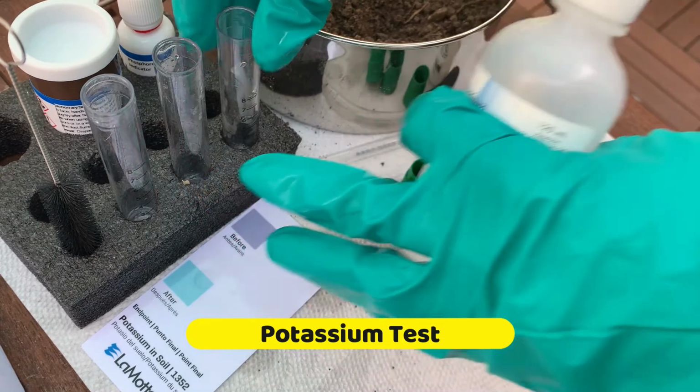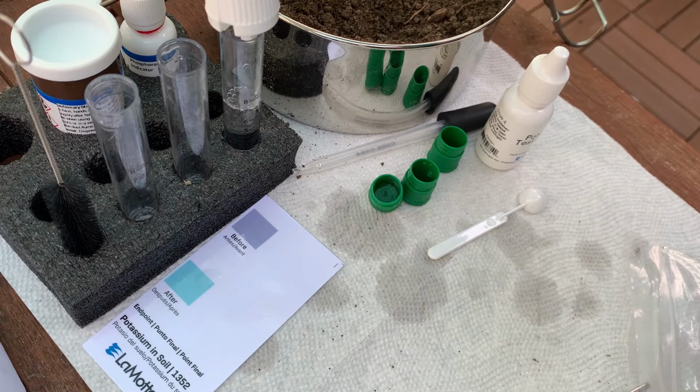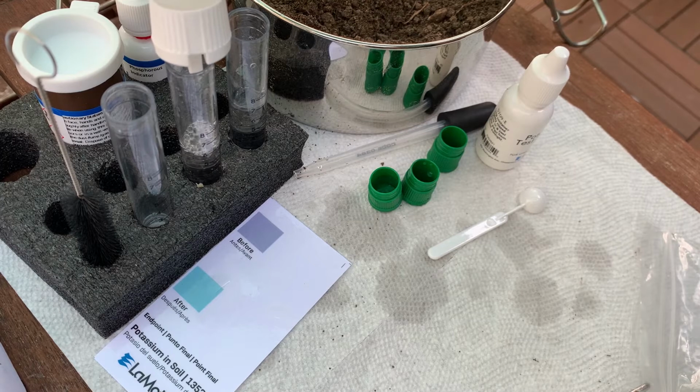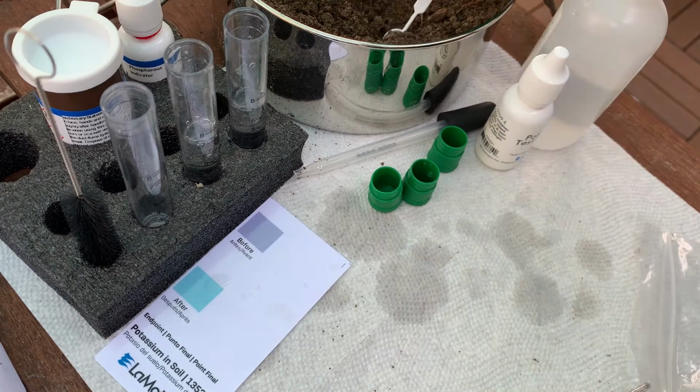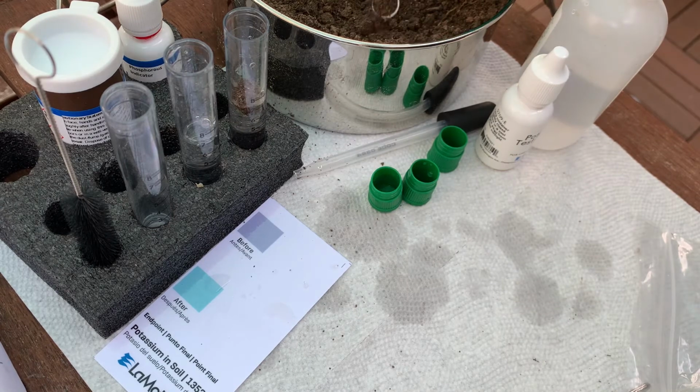And now let's do the potassium test. Once again, I recommend you clean everything up and only have potassium out here. And if you read the instructions, there's a chance you'll need to repeat steps 1 through 4. So I recommend just go ahead and do it twice in the beginning, and you'll save yourself some extra time.